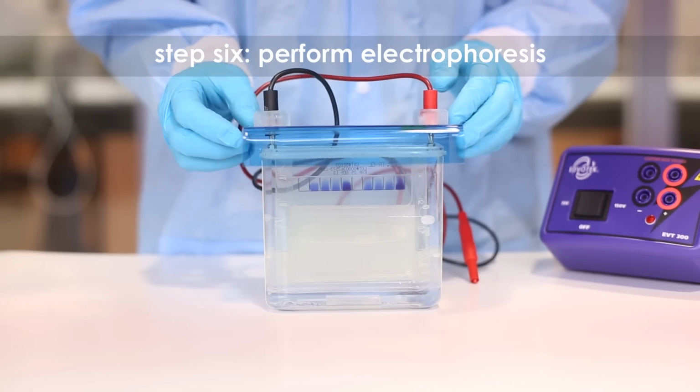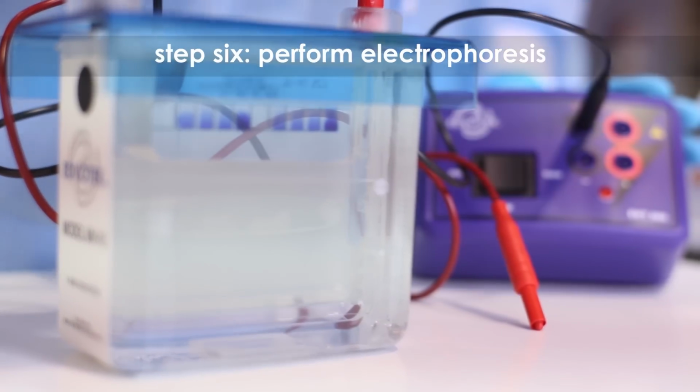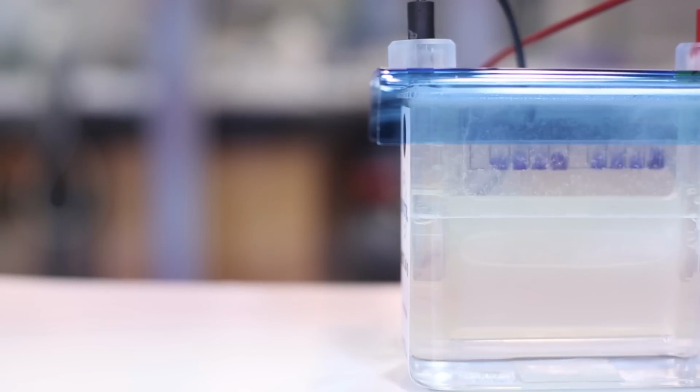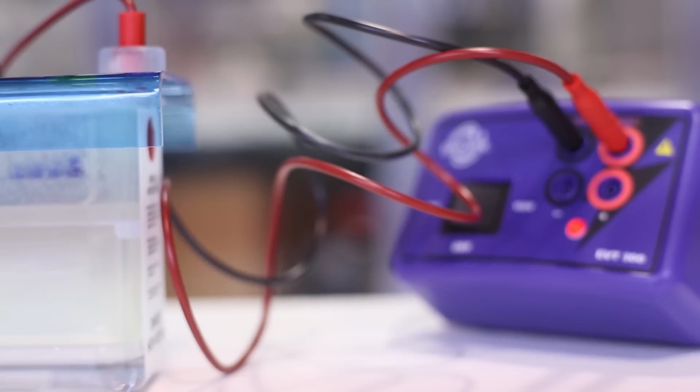Step 6. Place the safety cover on the electrophoresis unit. Connect the leads to the power supply. Set the power supply to the required voltage and perform electrophoresis. Refer to the experimental instructions for time and voltage guidelines.